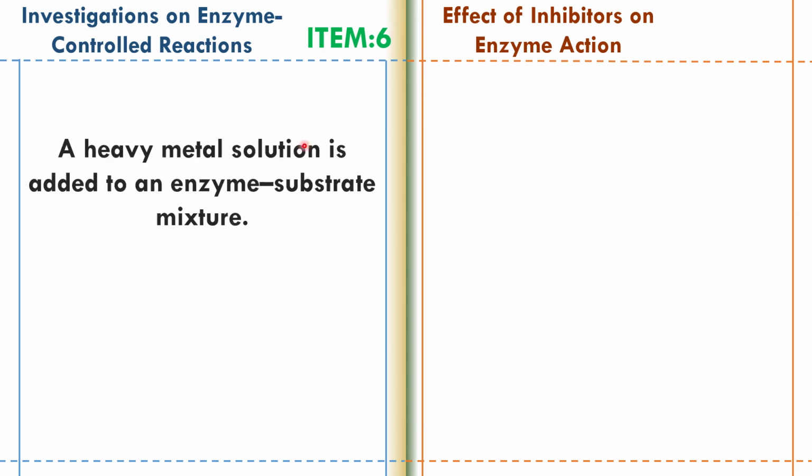Investigations on enzyme-controlled reaction. Item 6. Effect of inhibitors on enzyme action. A heavy metal solution is added to an enzyme substrate mixture.